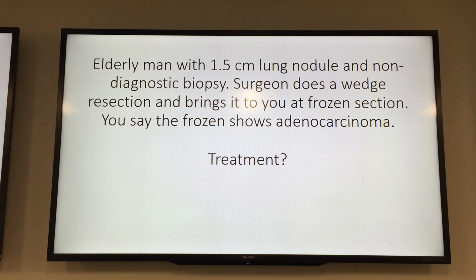So the bottle, now let's take this analogy further, okay? Here's the upper lobe and the rest of my body is the middle and lower lobe, right? So let's say this is the bronchial margin. With that is the vascular margin too. So you cut that and give a shave of this. So bronchial margin, vascular margin. But the bottle is actually connected to the rest of the lung too, right? So that is the so-called parenchymal margin, where the lobe is connected to the rest of the lung.